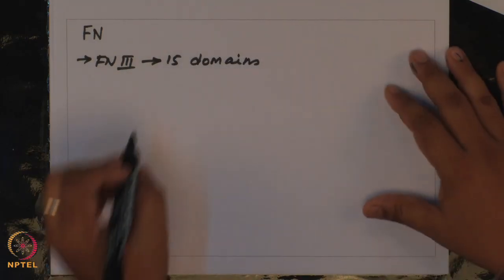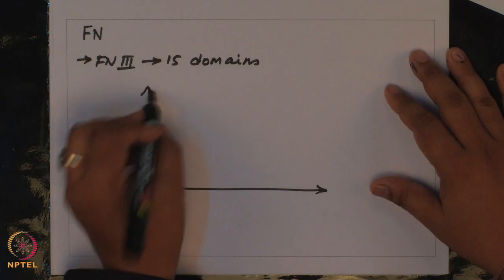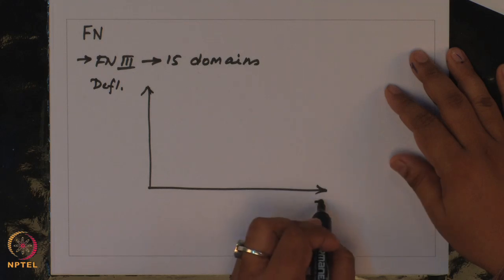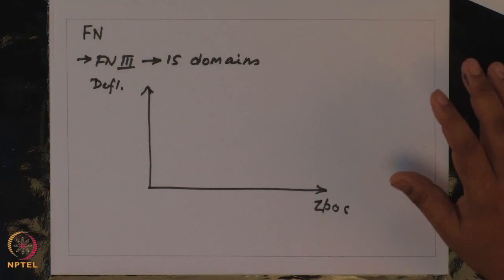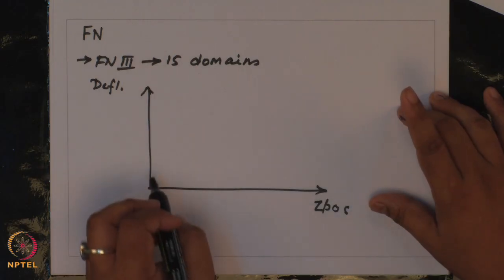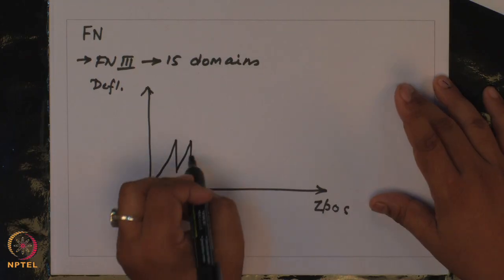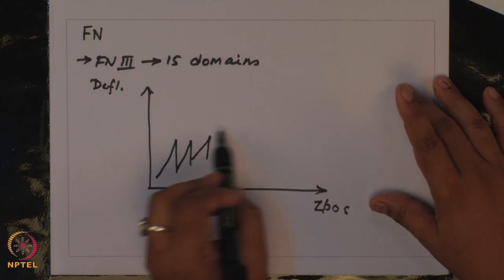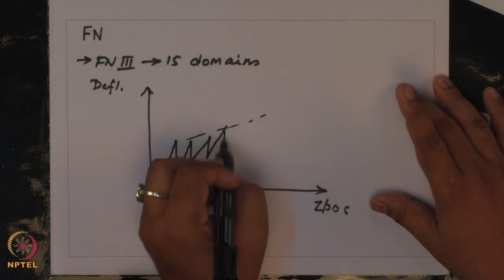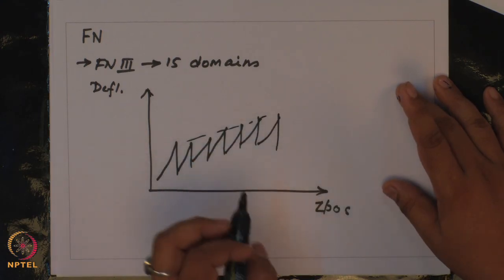Now, if you pull this long a protein, one thing that you observe is you will get these multiple peaks, and so on and so forth.